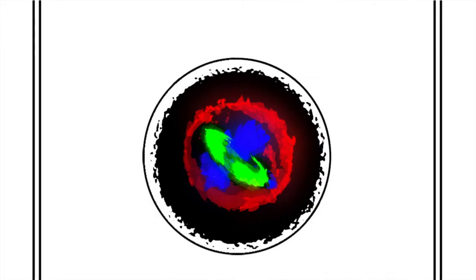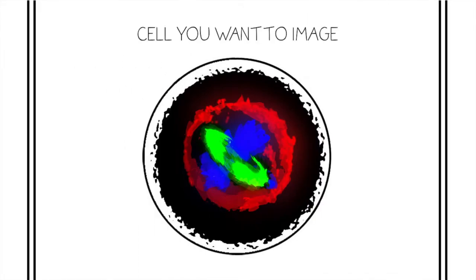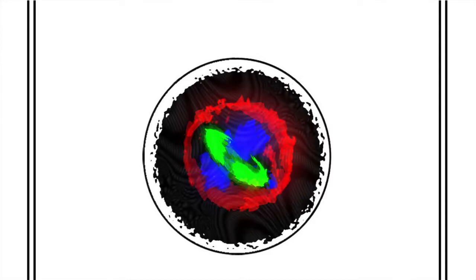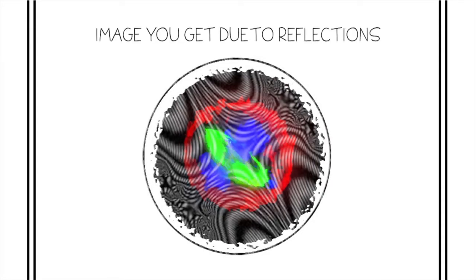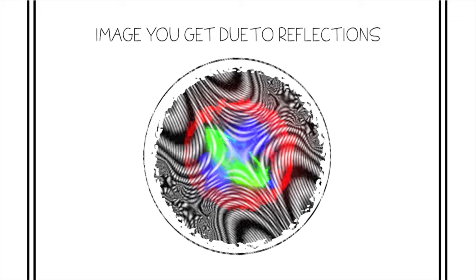When imaging challenging specimens, unwanted light due to reflection or autofluorescence can be a problem. This reflected light is detected alongside your sample's fluorescence emissions, interfering with the accuracy of your images.